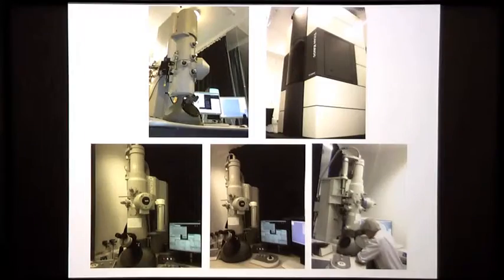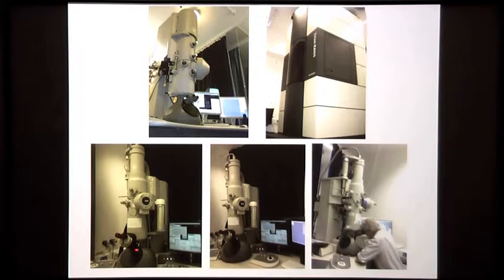I think maybe a lot of you can recognize which one is which, but when I put up a photo, I could not really recognize these three. The bottom one is basically our medium resolution microscope. From here we get two splits: this one is no cryo, general use, and this one is cryo, and we have a T10 and T12, cryo and no cryo. And then this one is T12, and then this is the Polara. When we go cryo, we don't know what happened inside.